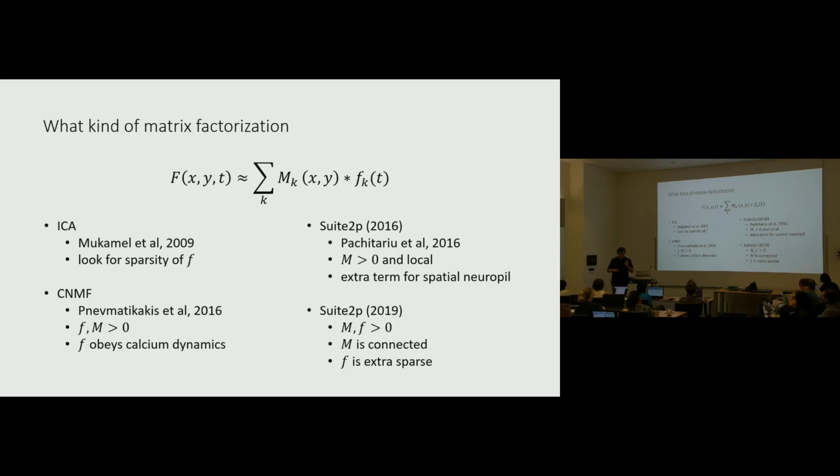Now, let me emphasize that in this newest version of suite2p, this high-pass filtering is just for the purpose of finding the ROIs. We don't want to high-pass filter the movies and then extract fluorescence from them. That would be kind of terrible. So we want to be very careful to keep separate the steps where we find cells and estimate their masks, and the step where we extract fluorescence.